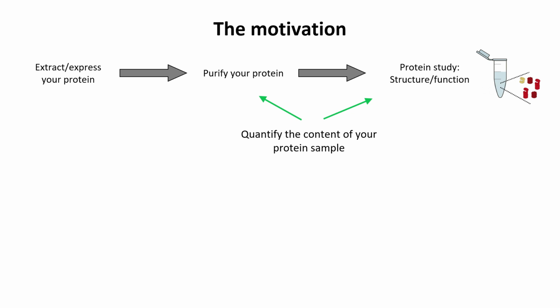Ideally, you would like to know the content of your protein sample during the purification, so you can optimize your purification protocol in the most efficient way, and when you screen for the best conditions for your protein study, and also even during your study. Therefore, a handful of techniques were developed to address this need, where ideally you will get information in high resolution with minimal consumption of your protein and, of course, high throughput, so fast.